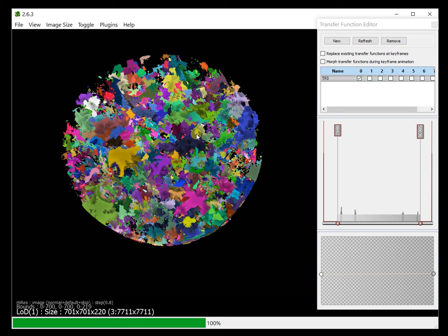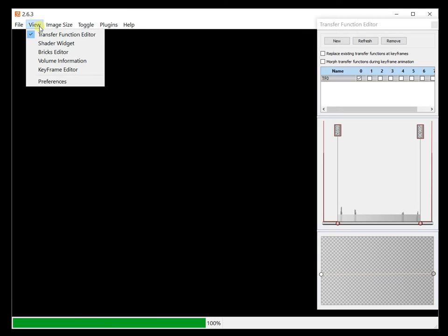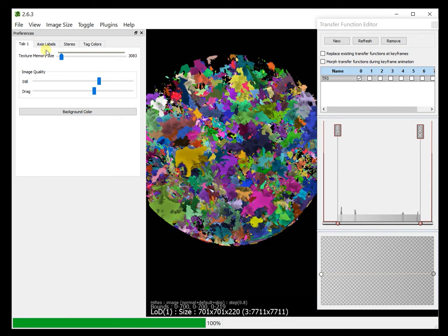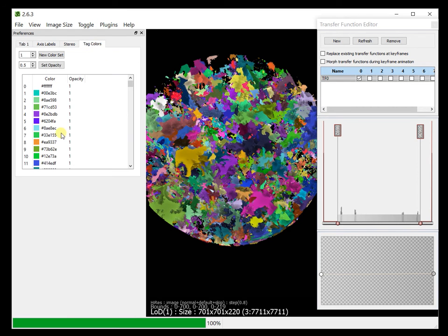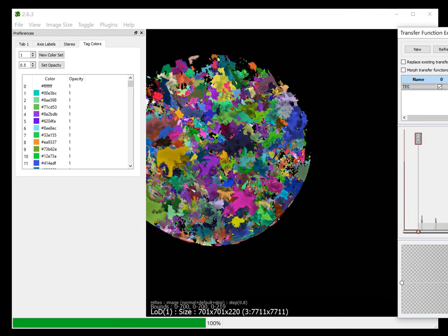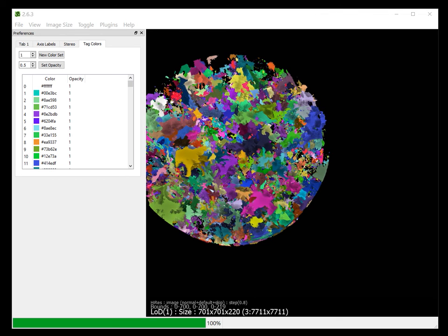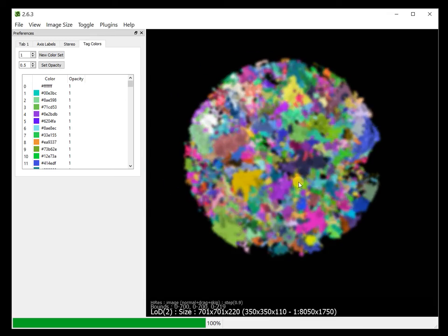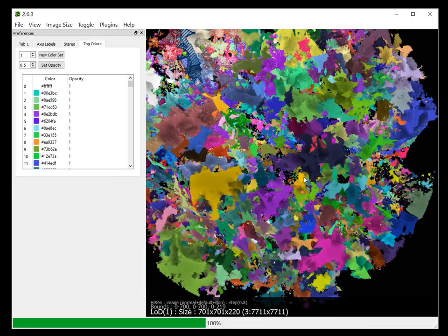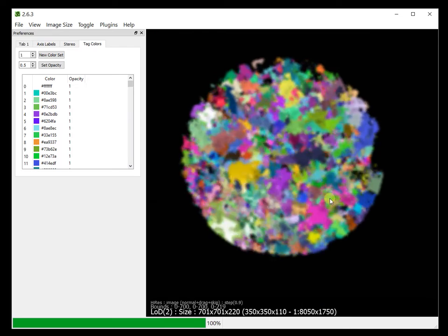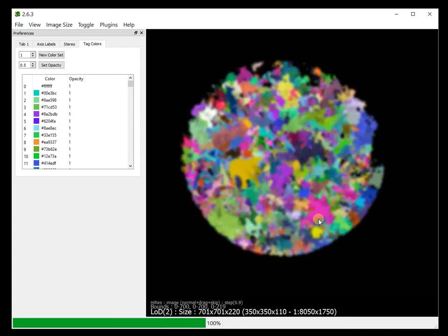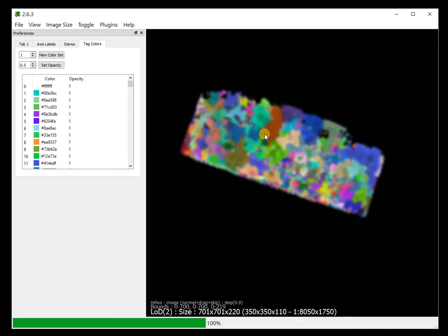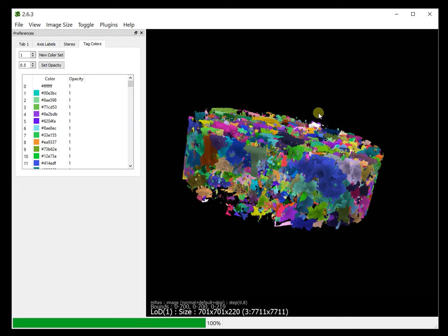Okay, so what is happening here is in the preferences, it is using these tag colors. I'll just move this out. It is using these tag colors to color the data.